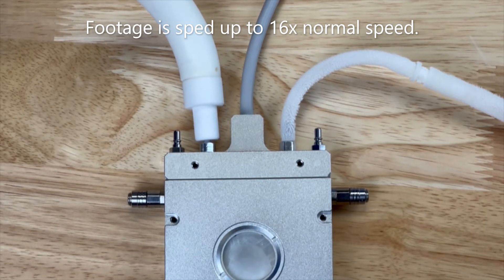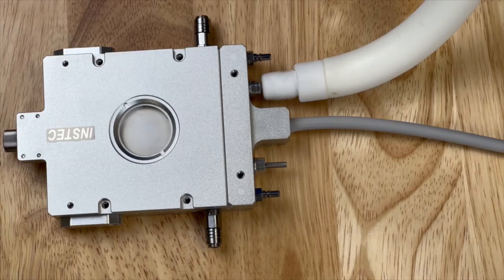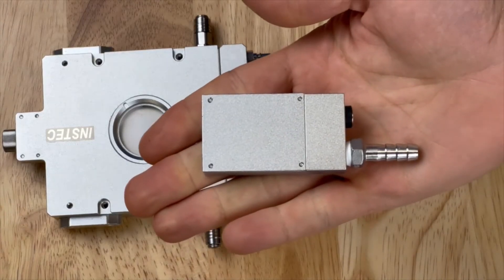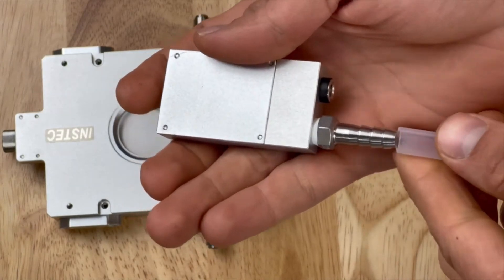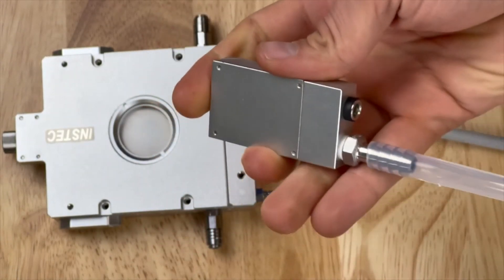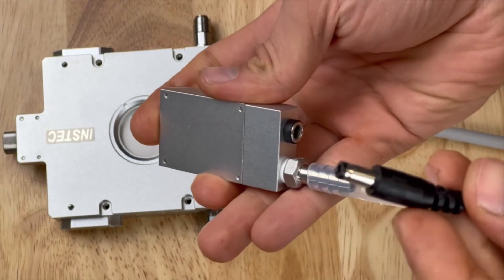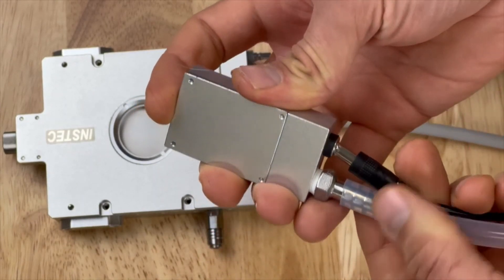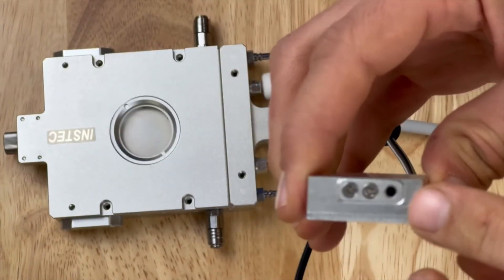INSTEC offers vacuum insulated tubing or LN2 exhaust heating as an optional additional component. The LN2 exhaust heating is simple to use. Simply connect the standard silicone rubber tube to the outlet barb. Connect the power cable to the heater and the power supply. Then connect the exhaust heater inlet to the thermal stage cooling outlet port.